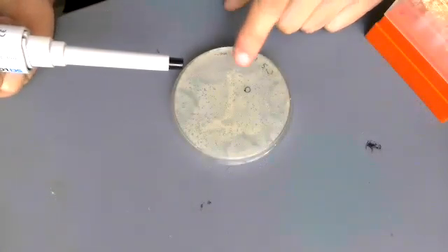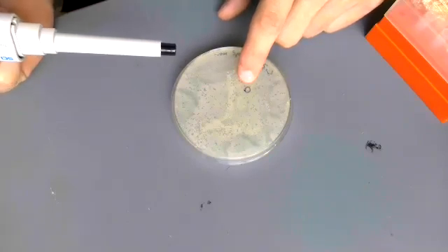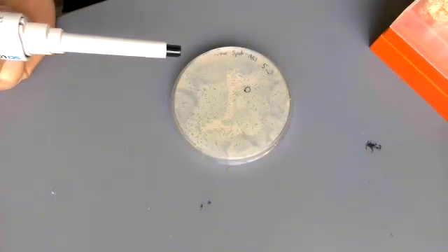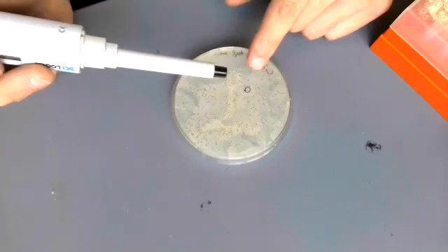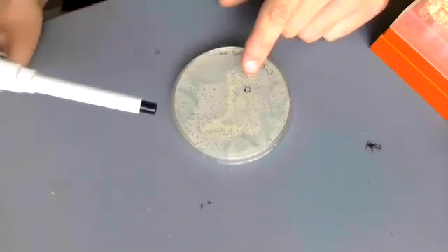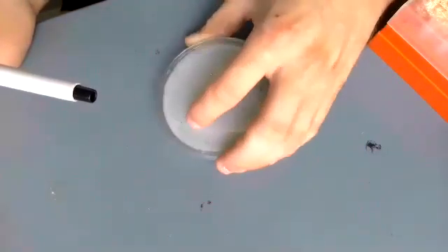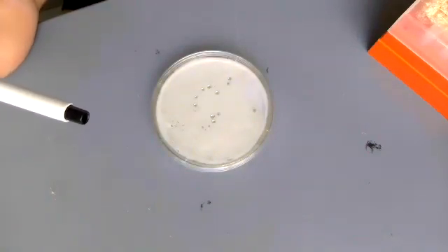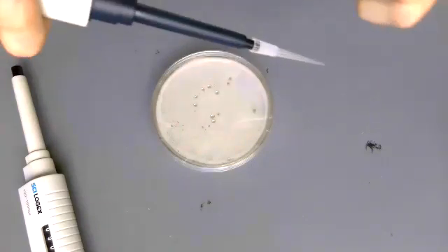On the bottom side of this plate, we have the plaque that we want to pick circled. What we're going to do is, once we flip this over, we're going to get a tip and lightly touch the top of the agar where that plaque is. Then we're going to shake that tip around in some phage buffer. I'll go ahead and put my phage buffer inside of a tube — I'm going to use 100 microliters for this.